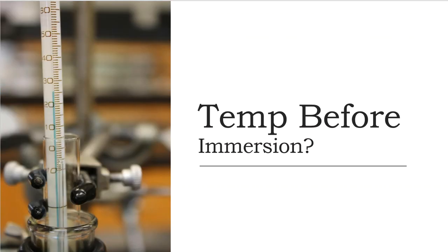All right, so temperature before, here we go. Here's the immersion line right there, nowhere near it. However, this thermometer is giving me 25 degrees, give or take, which is about room temperature of the laboratory at that time. So that's perfectly fine. However, this thermometer really does need to go into the solution all the way up to that immersion line.